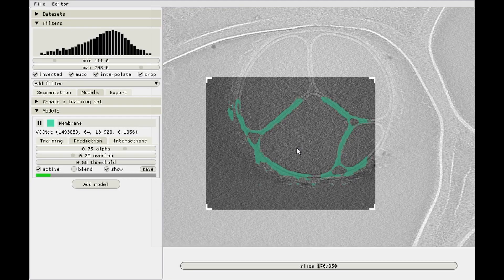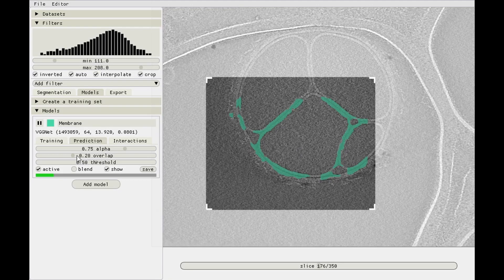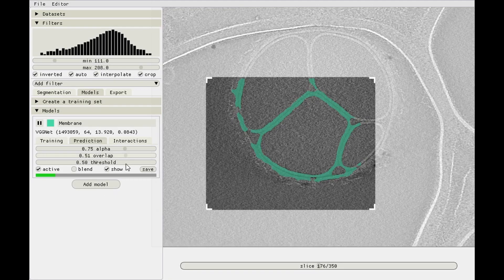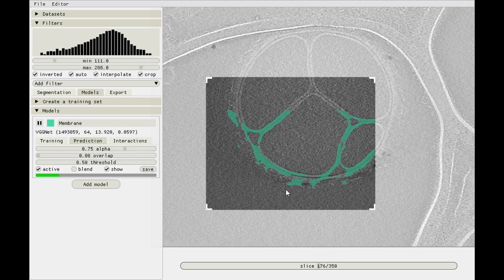It's not always being updated on the fly because every time you do so you need to do that on the GPU, and that actually slows down the training process. So it's better to be patient and not look at it too much, but if you're curious you can always have a look. And here you can also see the effect of changing the overlap between the boxes. If you set it to 0, then usually the bits at the edges of a frame don't get predicted as well.